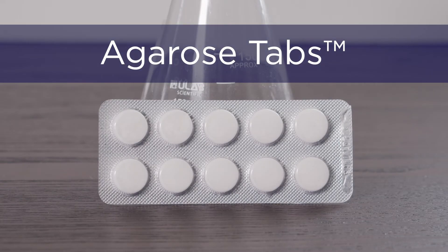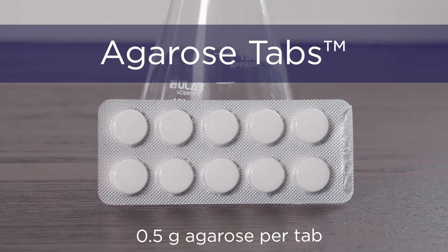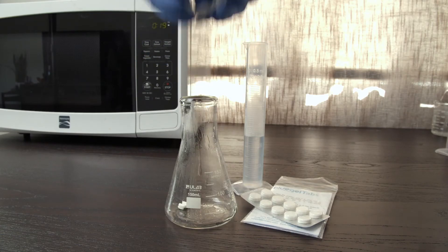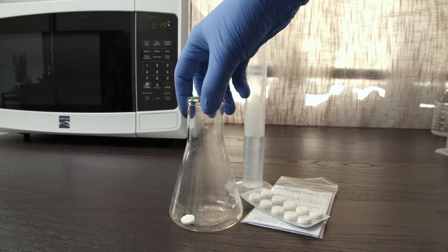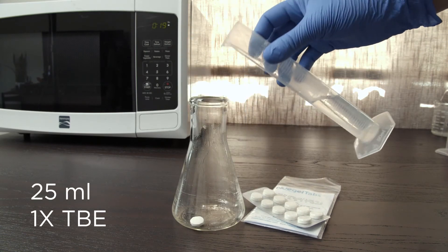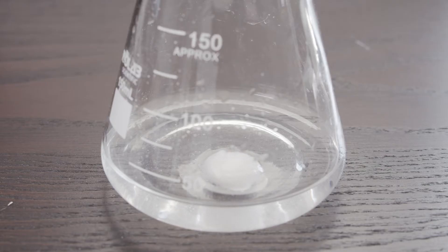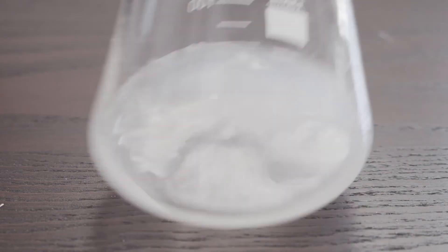Another convenient option that saves you from weighing agarose are plain agarose tabs. Each agarose tab is 0.5 grams of pre-weighed agarose, eliminating the time, mess, and mistakes that can come with weighing agarose powder. To cast a 2% gel, add one tab to 25 milliliters of 1x TBE buffer in a container with at least 100 milliliters capacity. You can adjust these volumes to cast any desired gel percentage or to prepare multiple gels at once. Let the tab soak until it breaks up and then swirl until it is fully disintegrated.